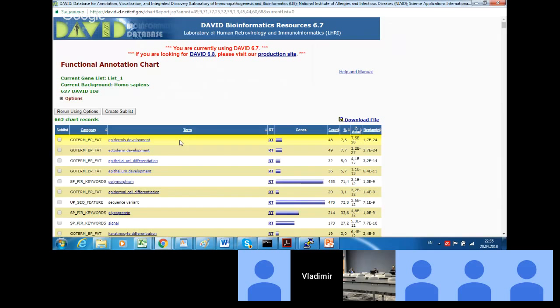So this type of pathway analysis is really frequent, but it is too simple for many cases, as this type of analysis ignores the majority of information we have after differential expression analysis. Here we simply ignored fold changes.